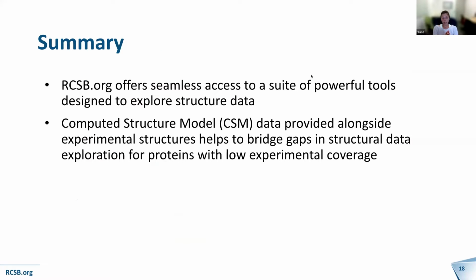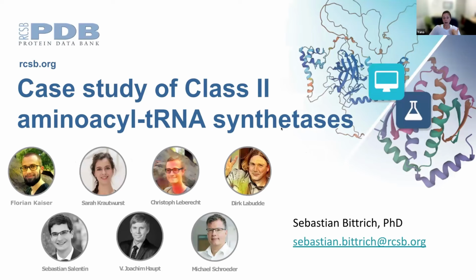So with this exercise, I demonstrated that RCSB.org offers seamless access to a suite of very powerful tools designed to explore structure data. Computed structure models available on RCSB.org, provided alongside experimental structures, help to bridge gaps in structural data exploration for proteins with low experimental coverage. That concludes my case study.